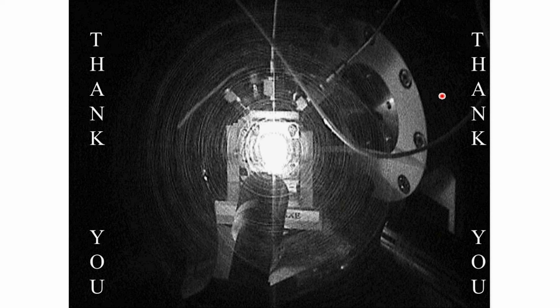I know that the question is related to the Fischer-Tropsch reaction. And the question is, are these selectivity trends confirmed via chromatographic method? The answer is, we confirmed the selectivity trend not by a chromatography method, but by mass spectrometry, and we saw really that at high temperature we have the formation of more methane than the other long chain hydrocarbons, and the reverse at low temperature.